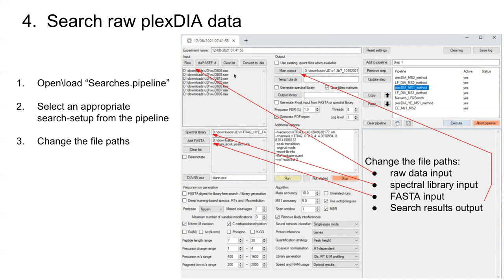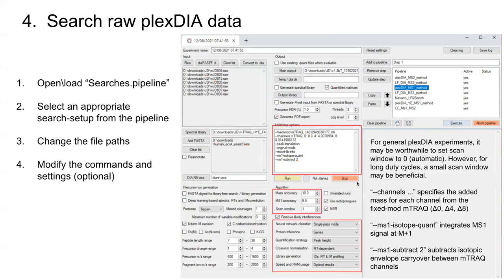If you have your own Plex DIA data, you can load that here, or you can use our Plex DIA raw files. Make sure these boxes are unchecked, because if you left them checked it would basically make a library all over again and you don't need to do that since we just made one. Most notable for Plex DIA is that you want to have this fixed-mod mTRAQ — this is exactly the same line we had when generating the library, saying there's a fixed mod at a certain mass on N-termini and lysines.